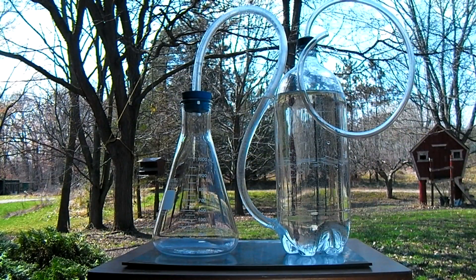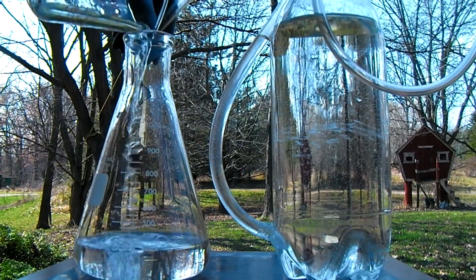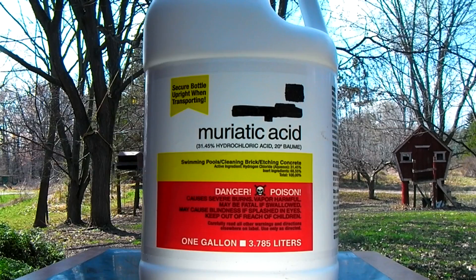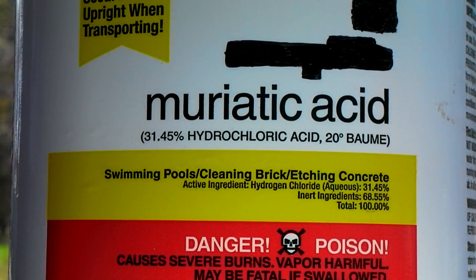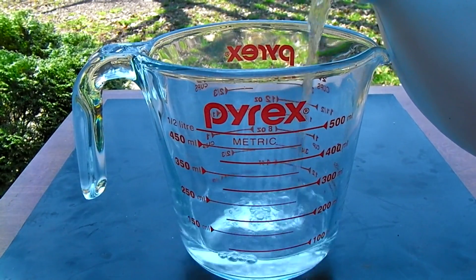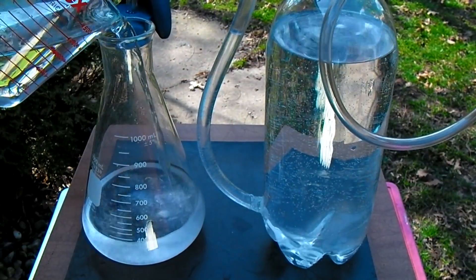Moving outdoors to begin this reaction, we will start by filling the 2 liter bottle ¾ of the way full with cold water. Another 300 milliliters of water is added to the bottom of the flask. Muriatic acid is the common name for hydrochloric acid, which will be the primary reactant in this process. This sort of acid can be purchased at almost any hardware store for only about $5 a gallon. 300 milliliters of muriatic acid is carefully measured and then slowly poured into the flask to mix with the water previously added.